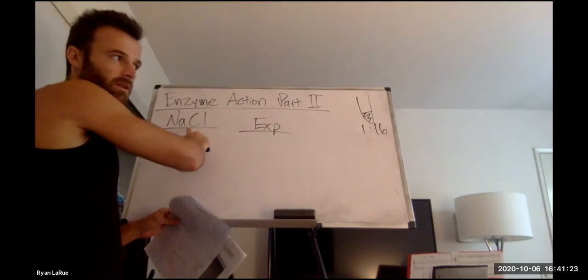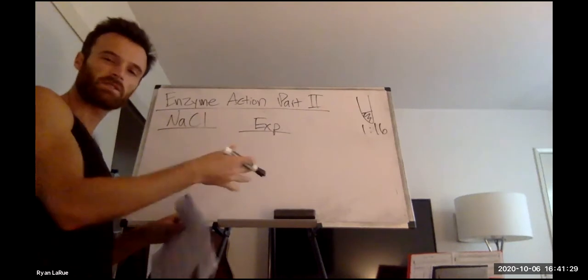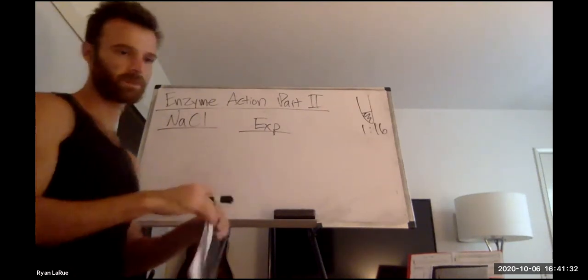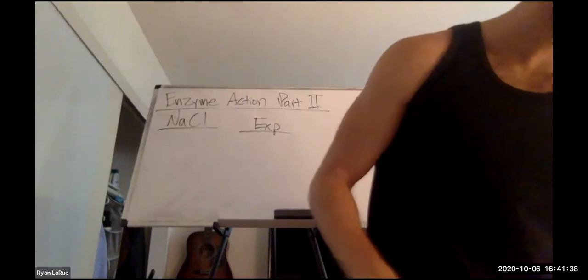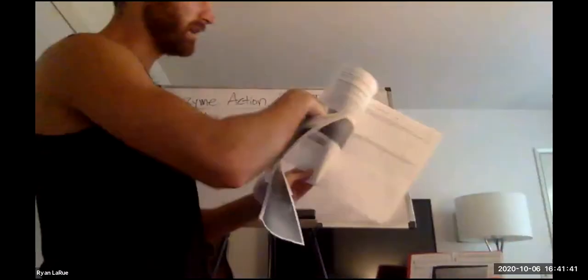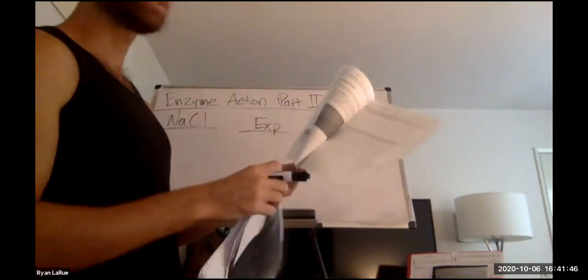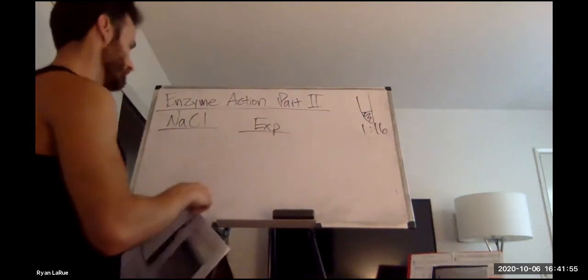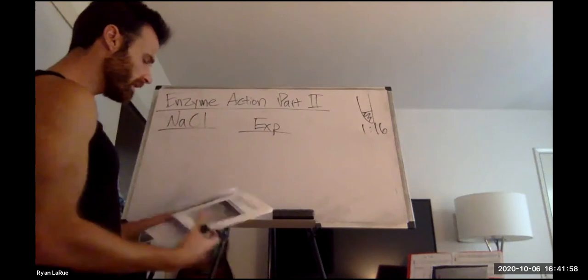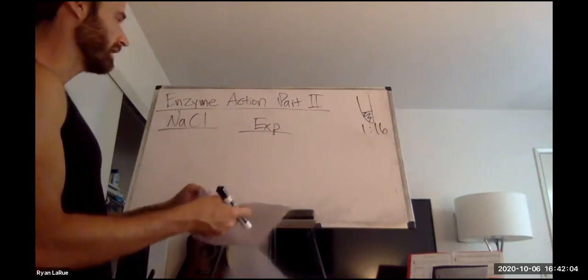So what that would mean is differing concentrations of salt. Stacy has a 1% NaCl, a 5%, 10%, 20%, and 30% that she used. But I'll just show you one example. We'll try the 1% NaCl. And then you would replace it for each differing condition of NaCl concentration. But let's just do an example for 1%. And this is how you would set it up.